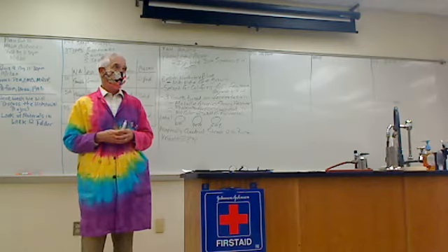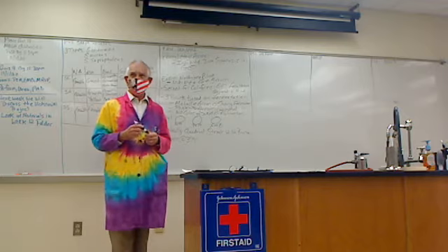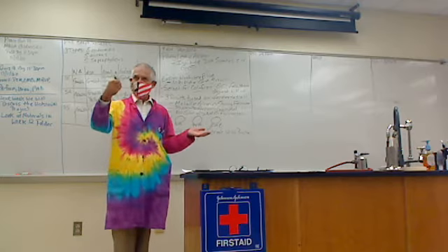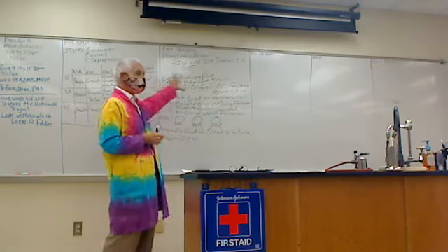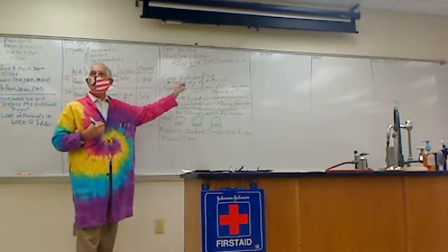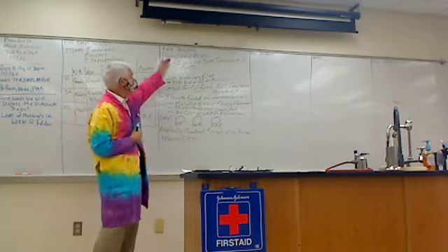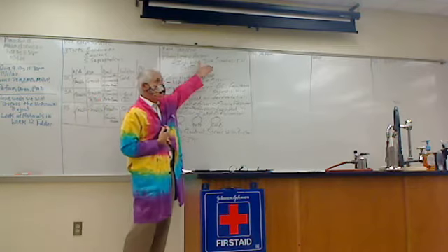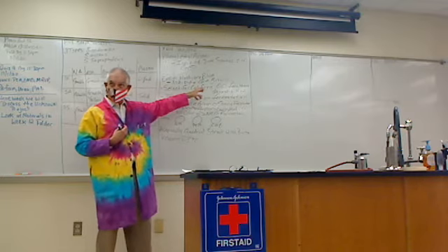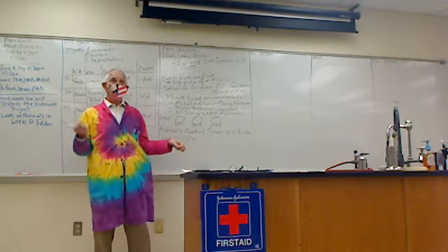Sound good? Okay. Now, another thing I know you worry about, because you guys always worry a month in advance about exams, am I right? Okay, I knew it, I could tell. So, for a lot of what you're going to be doing this week and finishing up next week, guys, you want to know what you're testing for and what positive results are. So for instance, you're testing here to see if DNA synthesis is inhibited or not. Here, you're testing for these coliforms, correct? Here's some of the results: green metallic sheen, pink to purple, etc.